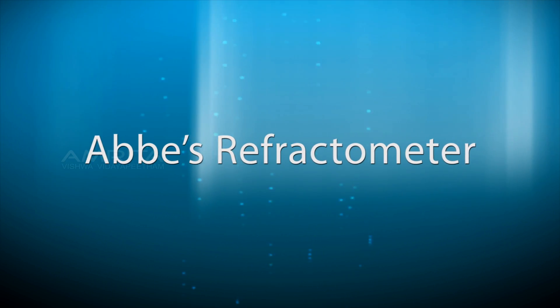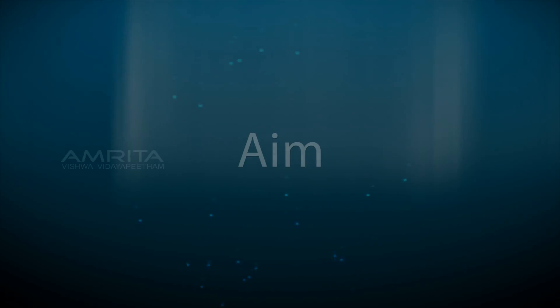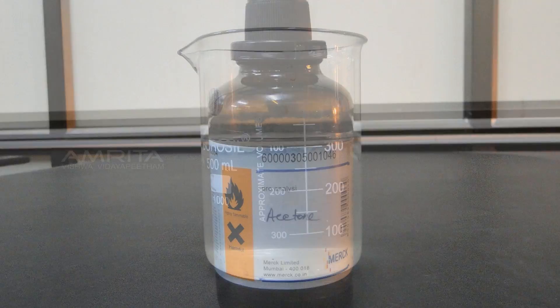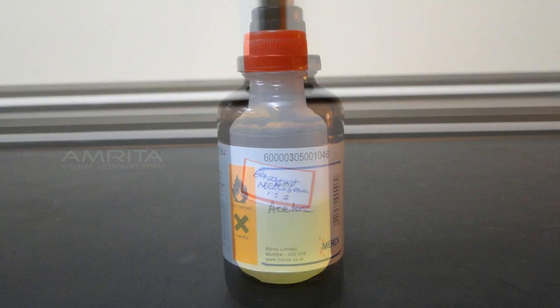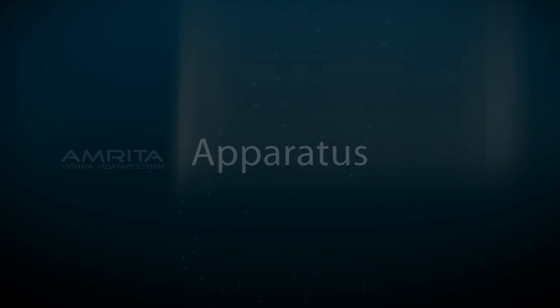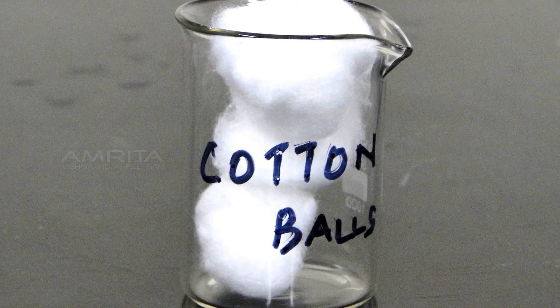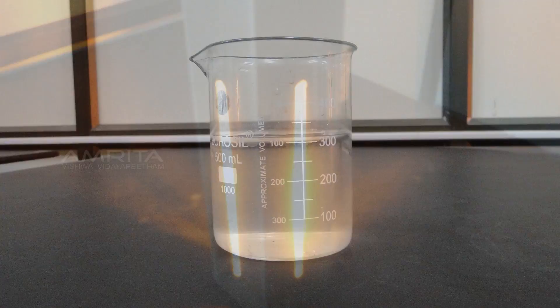An Abbe refractometer to find the refractive index of the given liquid sample. Apparatus: Abbe refractometer, cotton cloth, light source, and samples.